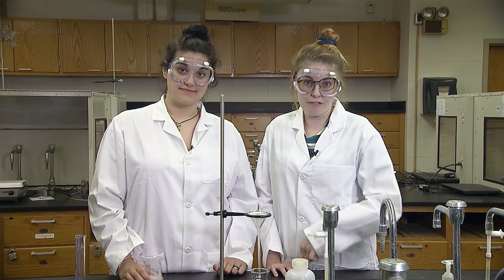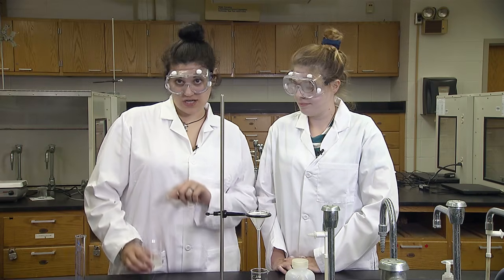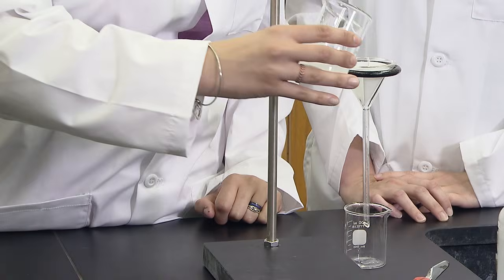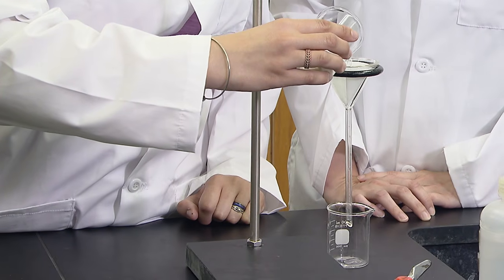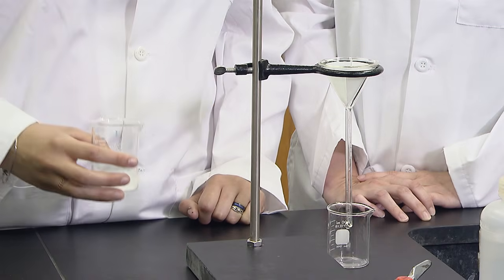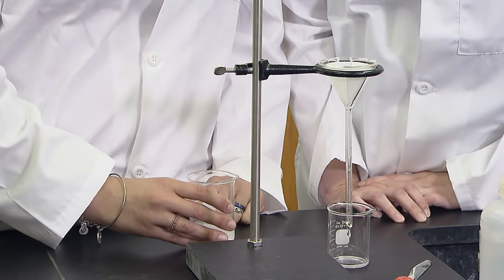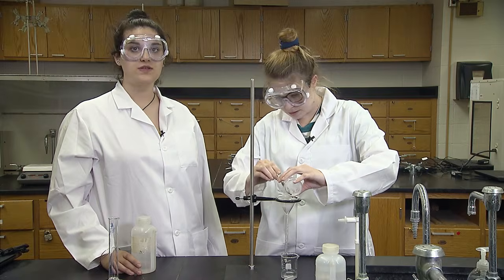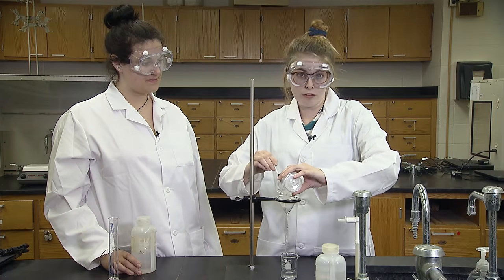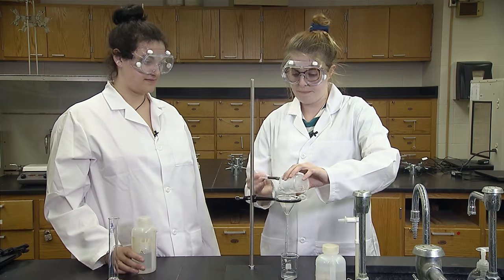I'm done stirring, so now we're ready to filter. Beaker 2 goes under the funnel. Start by pouring just the supernatant liquid, the solution on top, into the filter paper. That way the solid doesn't slow down the filtering process. Use a rubber policeman to scrape the solid into the filter paper. Then use a little water to wash the rest of the solid in.